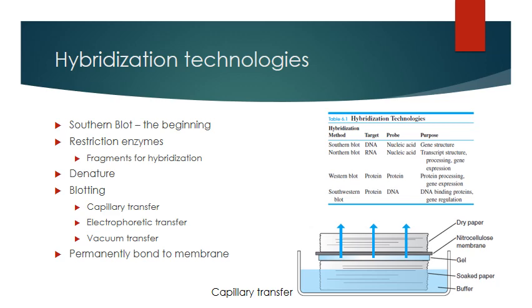The probes in Western blot are usually antibody probes. You can also do a Southwestern blot, which is a mixture where you have a protein target with a nucleic acid probe, a DNA probe that would be complementary to that. The processes are very similar. It's just that your target is different. It's going to sound very similar.